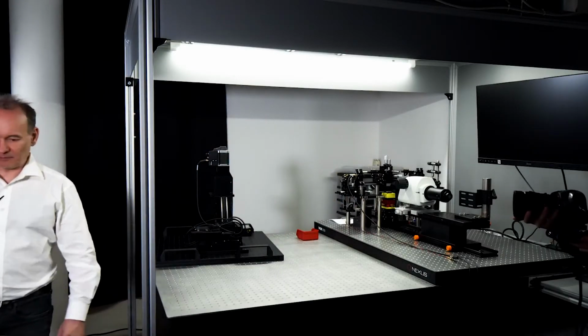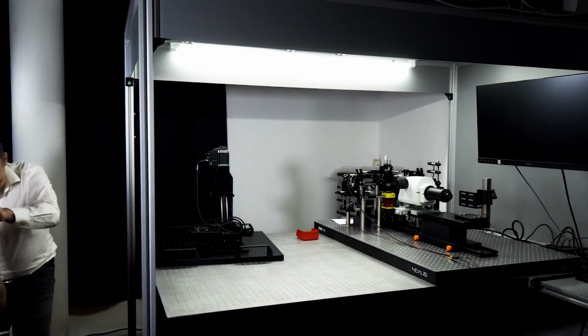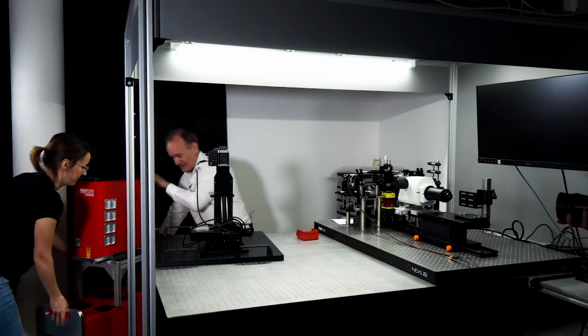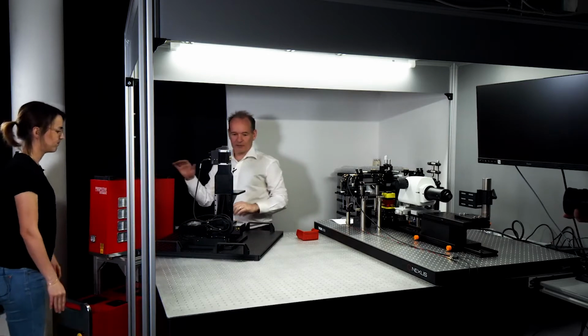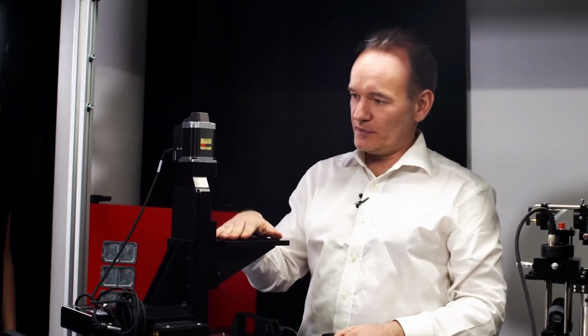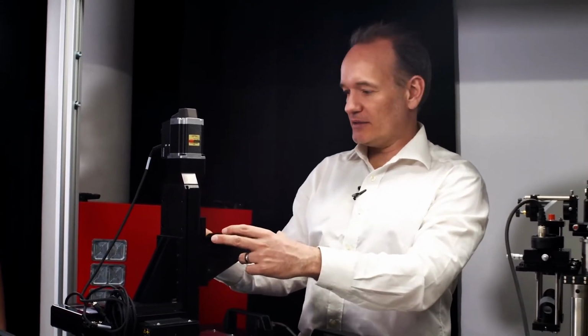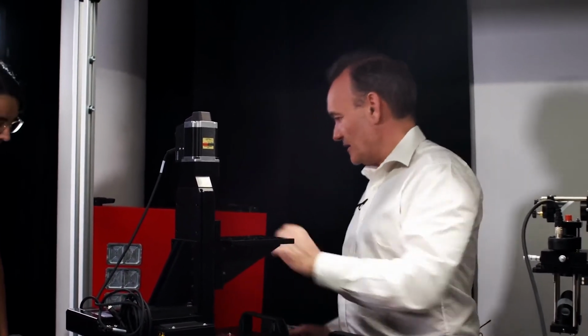controller and the scan head. Typically, we ship it on a pallet, but of course, we're not going to show you the pallet. As you can see here, this is the scan head. So we're going to position the scan head on top of the Z stage from Zebra. We're going to fix it to this plate. Later on, we're going to move it closer to the camera so you can actually see the imaging live.